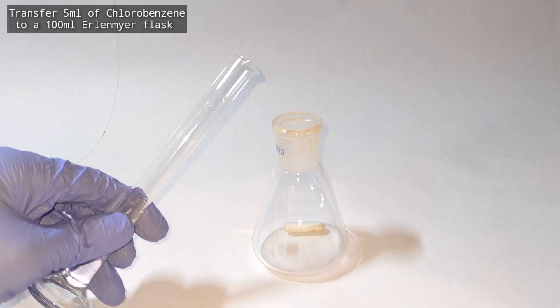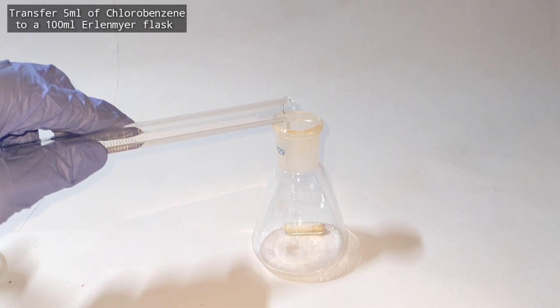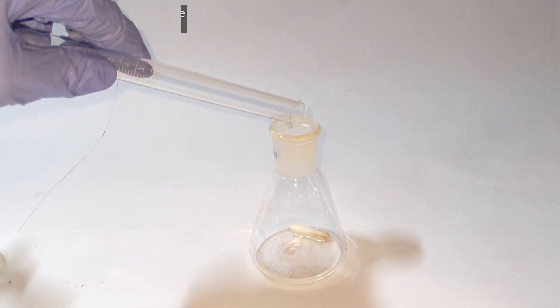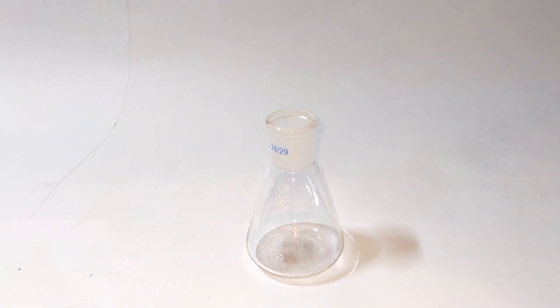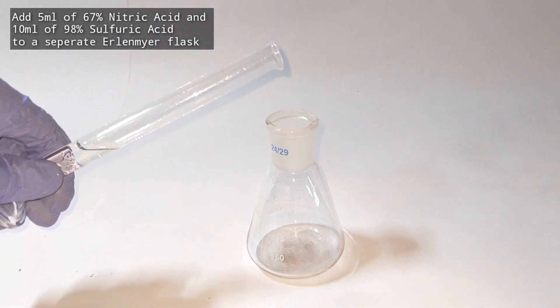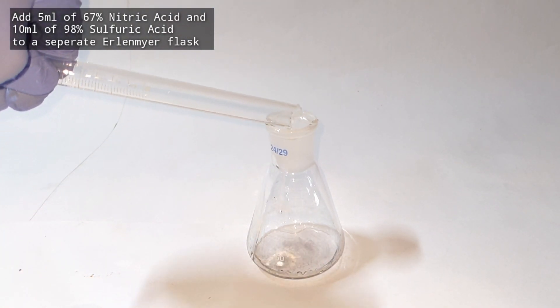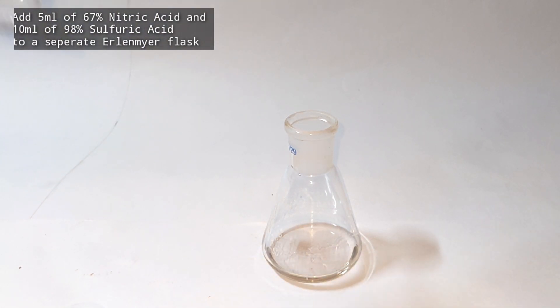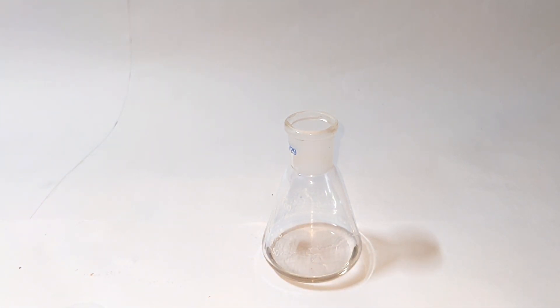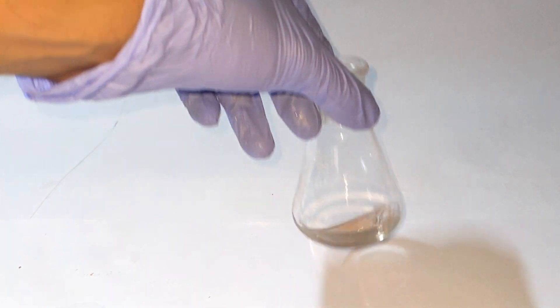Start by taking 5 ml of chlorobenzene to a 100 ml Erlenmeyer flask which is already equipped with a magnetic stirring bar. Take another 100 ml Erlenmeyer flask and add 5 ml of 67% concentrated nitric acid and 10 ml of concentrated sulfuric acid. Swirl the flask to mix both the acids.